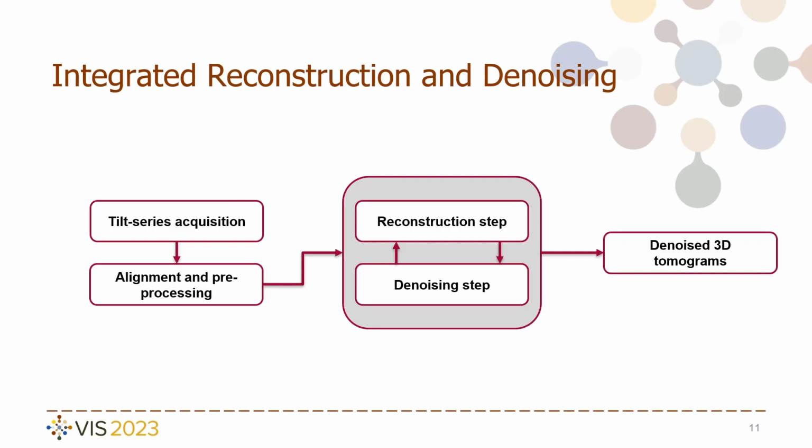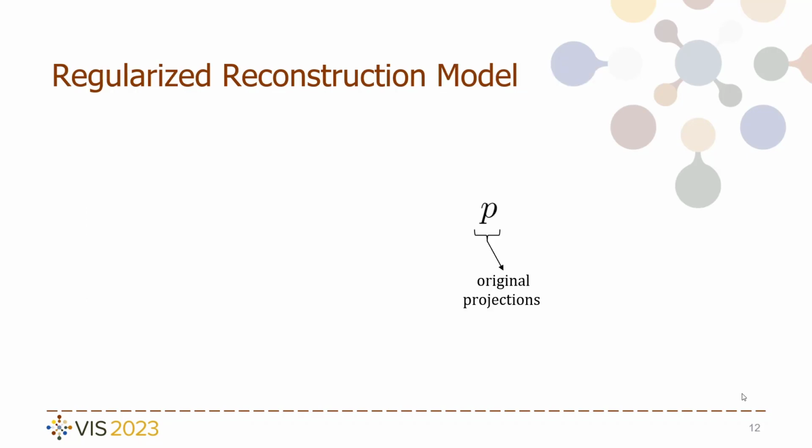We propose a GPU-accelerated framework for integrated reconstruction and denoising. The framework takes pre-processed tilt series as input and produces high-fidelity denoised tomograms that can be visualized directly. Let's see the most important details in our framework.